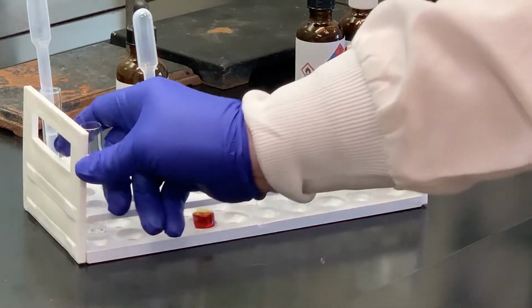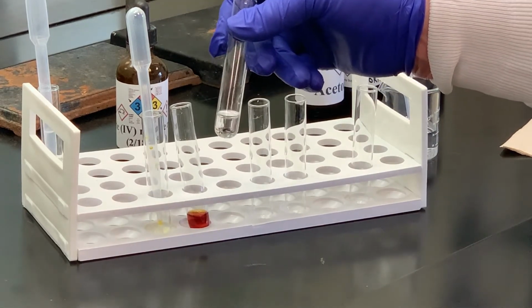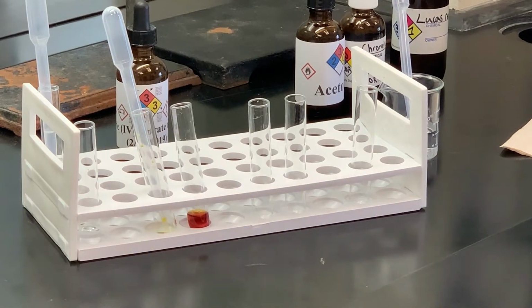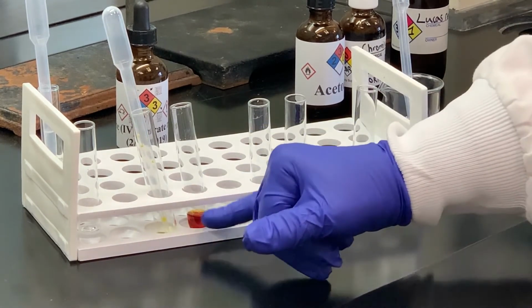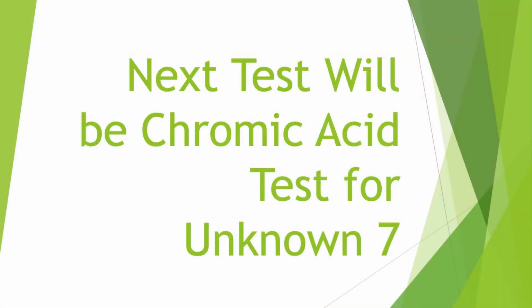Because at the beginning, when we said this was soluble in water and the pH was around neutral, 6.5 to 8, in that range, then that could have been a low molecular weight alcohol, it could have been a lower molecular weight aldehyde or ketone. So that's where we have to kind of focus in. Well, what test can we do that will either eliminate or be proof that we have a functional group? The ceric nitrate test, since it is low molecular weight, is positive, so I'm thinking it is a low molecular weight alcohol. But I need to be specific. I can't just say it's an alcohol. What class do I have? So the next thing we're going to do is the chromic acid test.